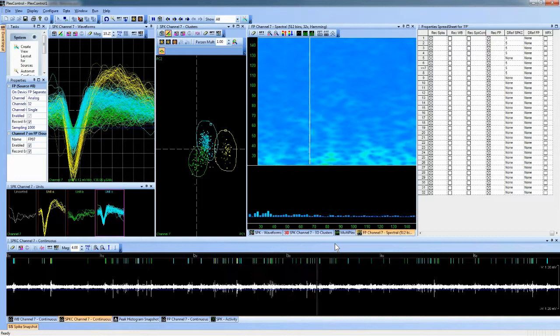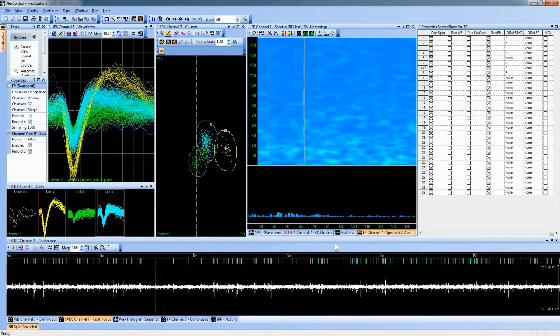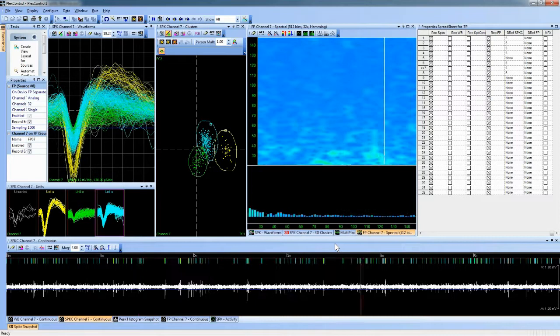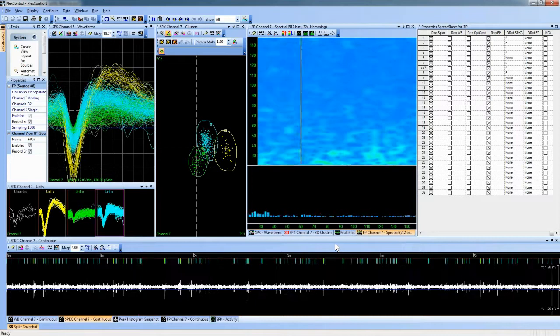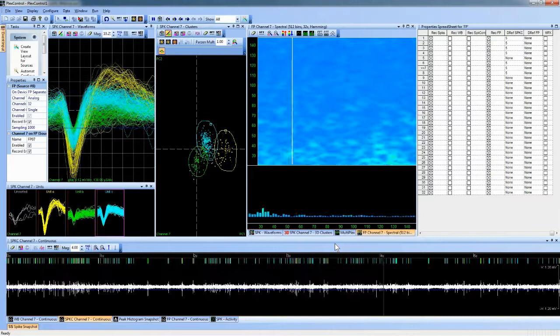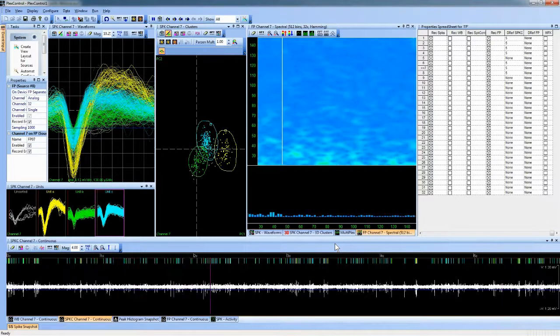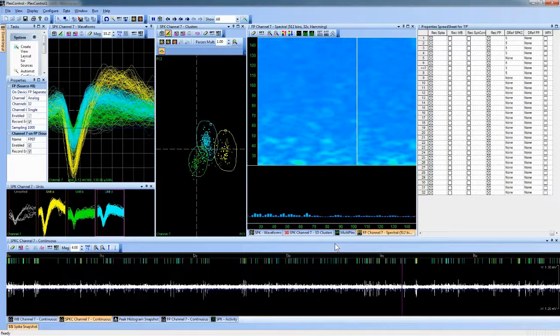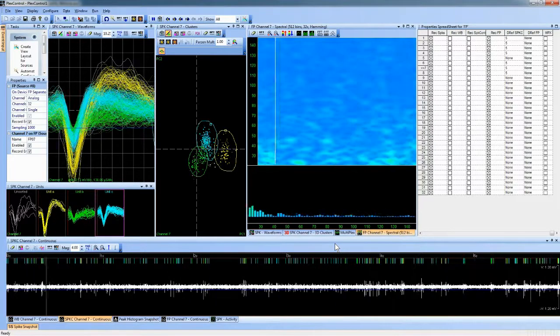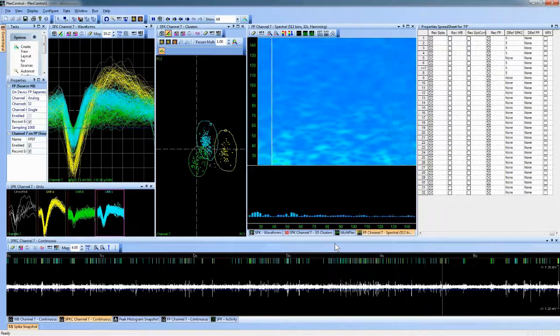So if you did all kinds of thresholding and all kinds of different extractions and sorting and referencing and all that kind of stuff, and potentially wanted to undo some of that afterwards, you could undo that or make different changes if you also had the wideband data. In offline sorter, you can load in a wideband channel, you can high-pass filter it and turn it effectively right back into the continuous spike data that you were looking at online.